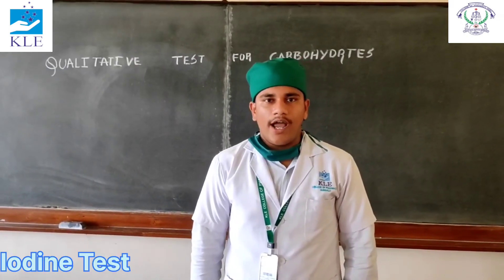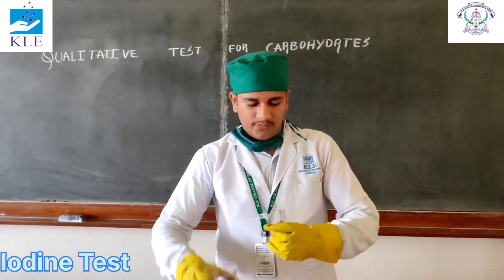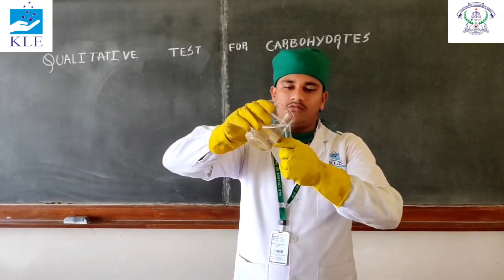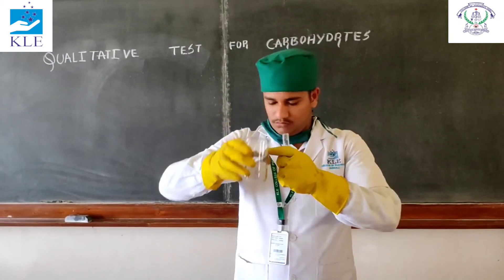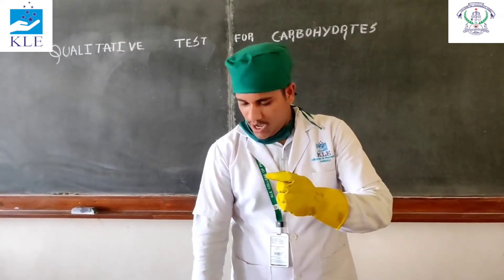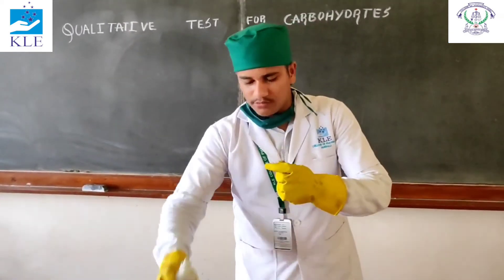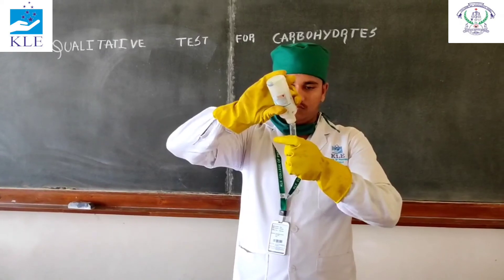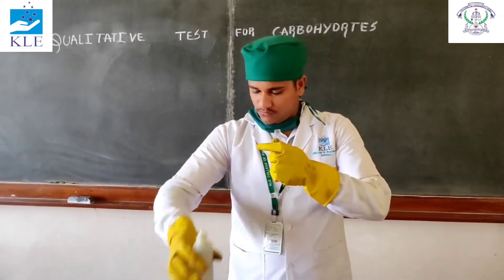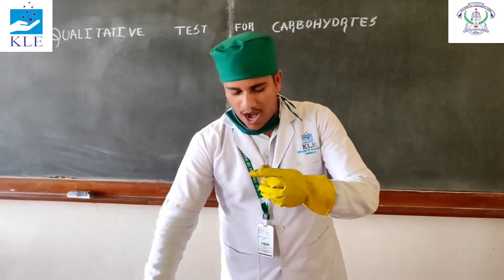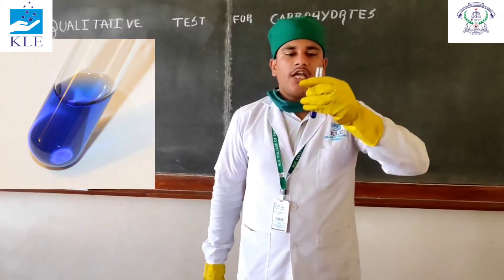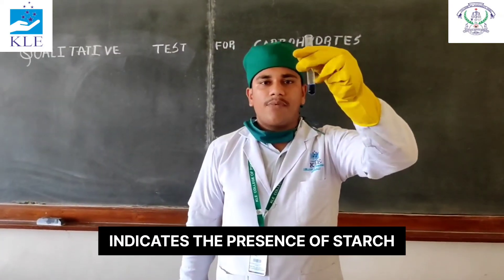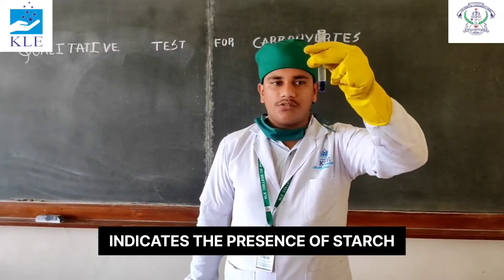Iodine test: take 2 ml of sample solution and add 2 drops of iodine solution. After adding, we can observe the appearance of a blue colour, which indicates the presence of starch.